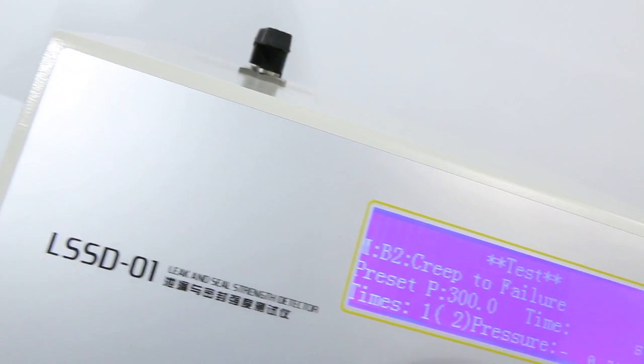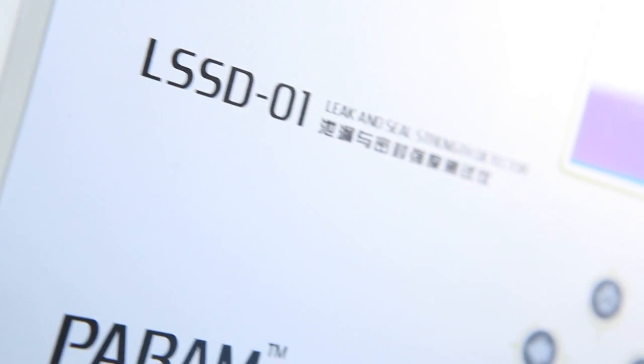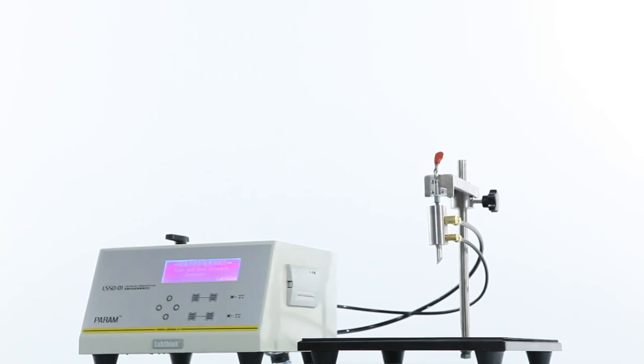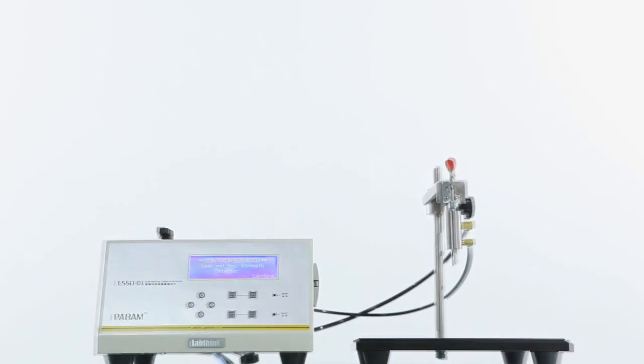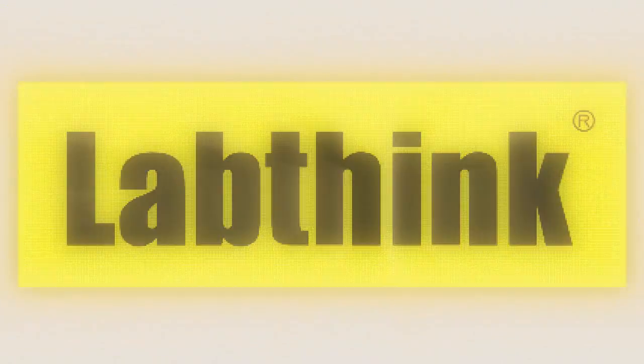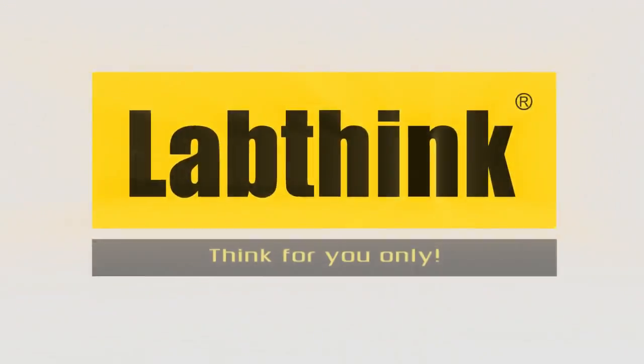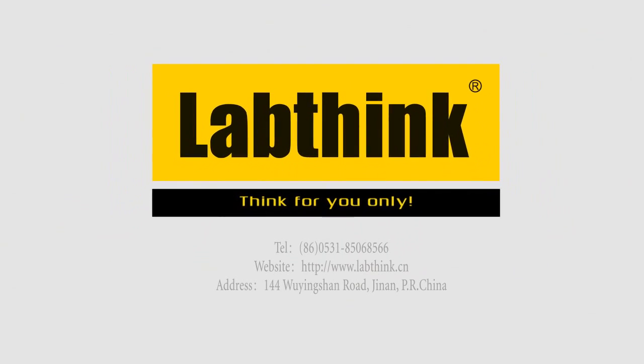LSSD-01, your excellent choice for automatic leak and seal strength detectors. LabThink. Think for you only.